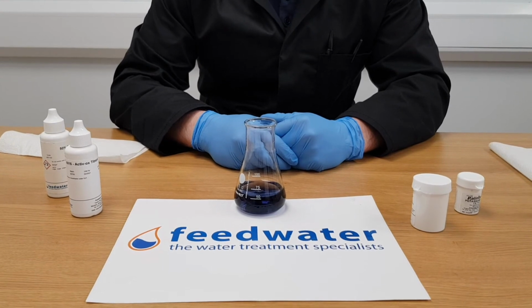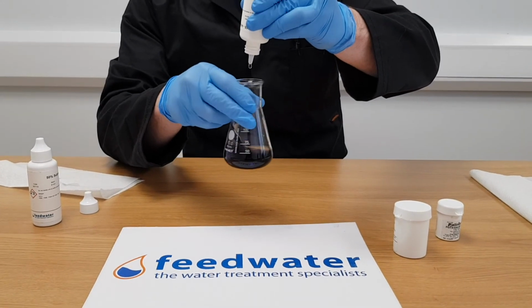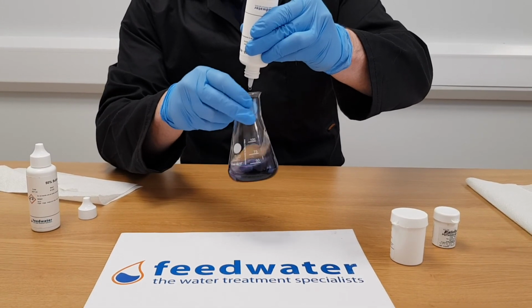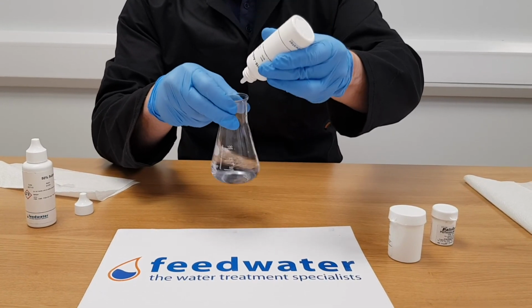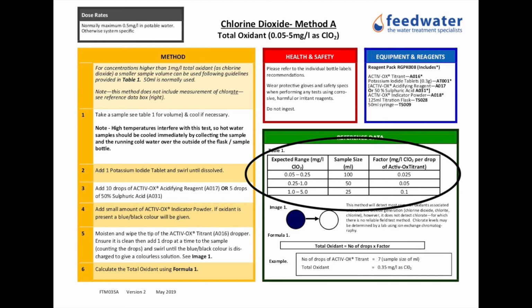Add 1 drop of Activ-Ox titrant at a time to the sample, making sure you count the number of drops and swirl until the blue-black colour disappears, leaving a colourless solution. The total oxidant is calculated by multiplying the number of drops by the factor based on the table shown. For example, 20 drops of Activ-Ox titrant times by a 0.05 factor equals 1 ppm as chlorine dioxide.